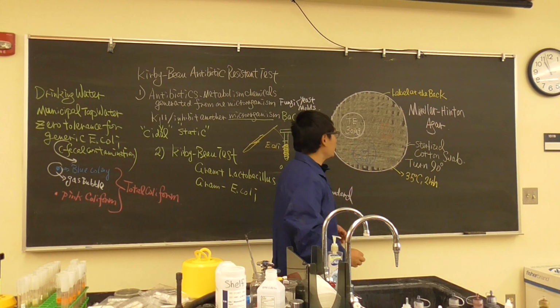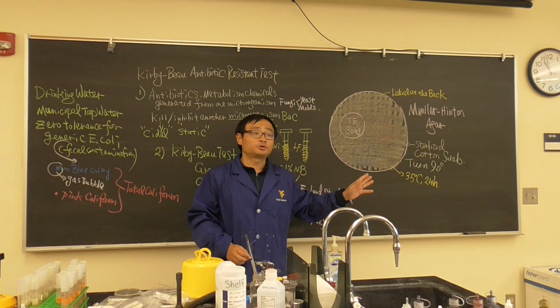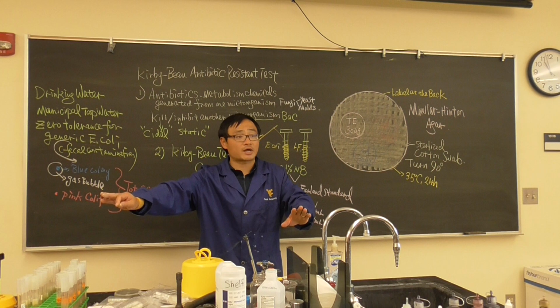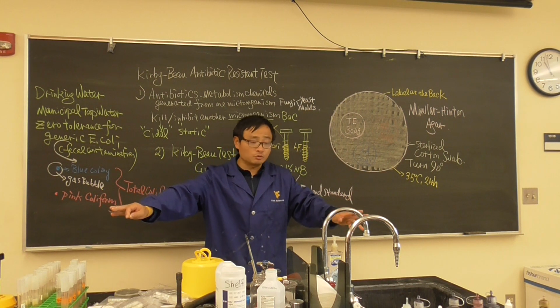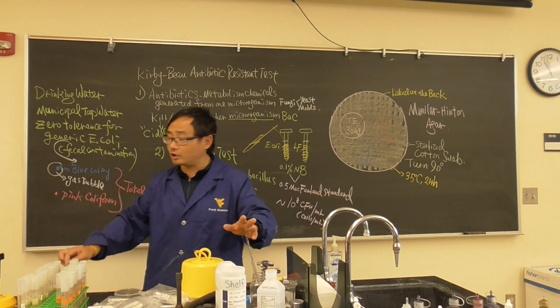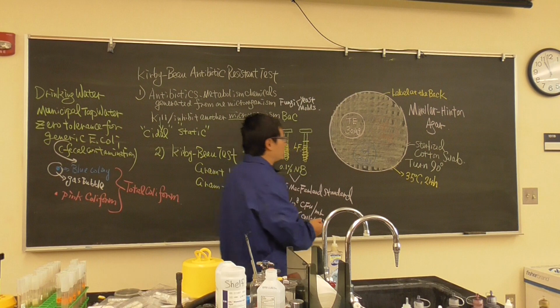Now Thursday we don't have the lab, but you can come back to see your plates. I'll have the ruler on the bench, you can grab it to measure. Because if you do the observation next week Tuesday, it will sometimes be horrible. So I encourage you, after the exam, you can come back to see it.